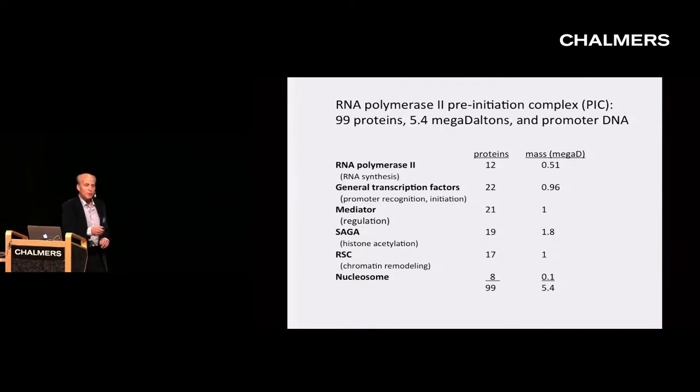Francis Crick is supposed to have said, if you want to understand function, study structure, to which many object, if you want to understand structure, study function. Regardless, we have pursued structure, beginning with that of RNA polymerase II, and as many of you will be aware, about 15 years ago solved a structure of the polymerase in the act of transcription with the DNA and RNA both present at near atomic resolution.